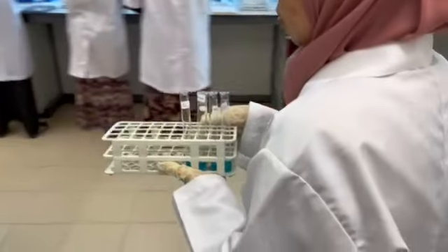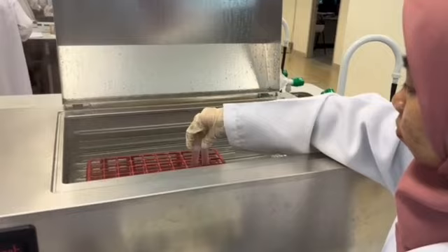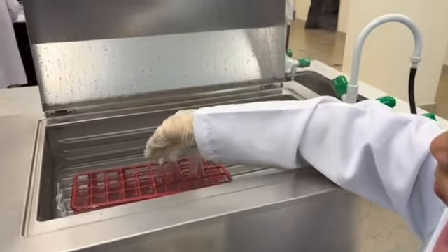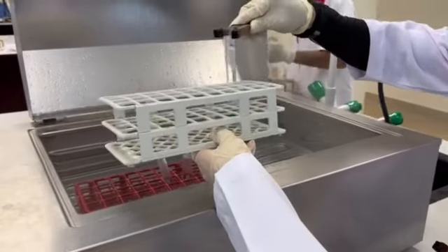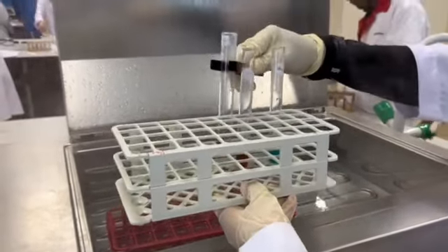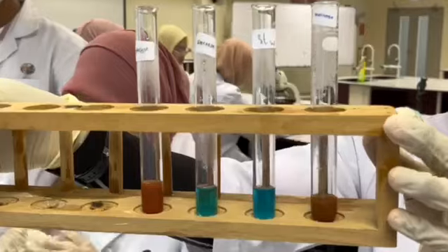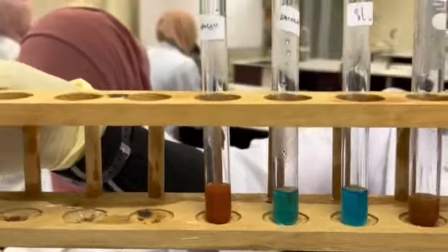Then heat briefly in boiling water for 2 minutes. Cool them down before you observe any changes and record the result. The solutions of sucrose and starch remain blue, while glucose and maltose change from clear blue to brick red.